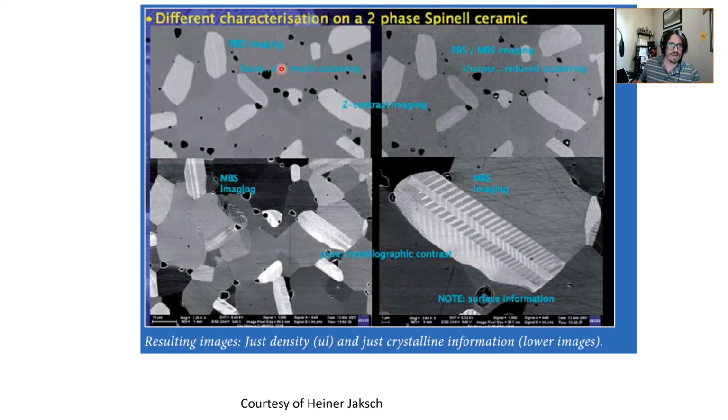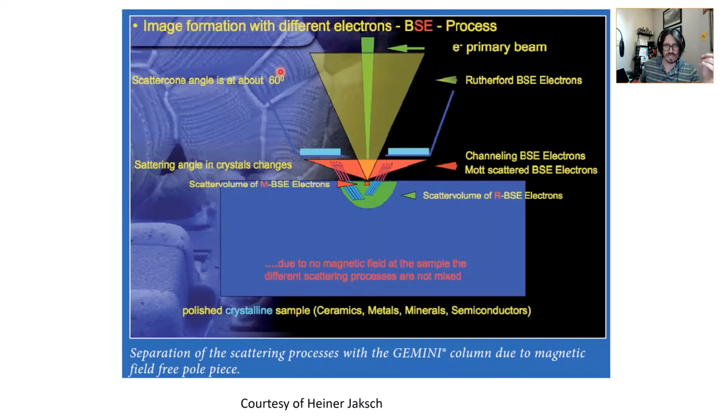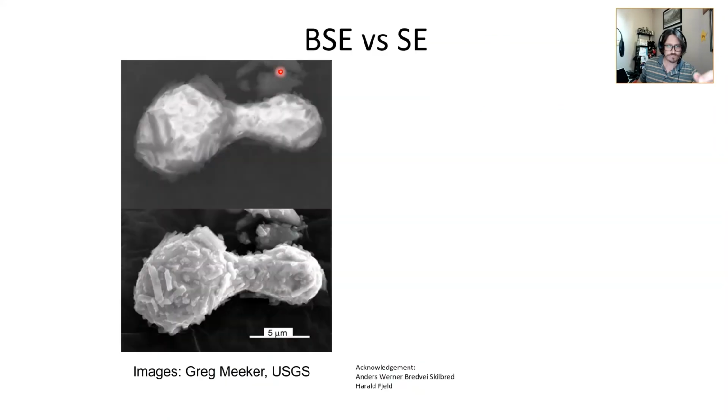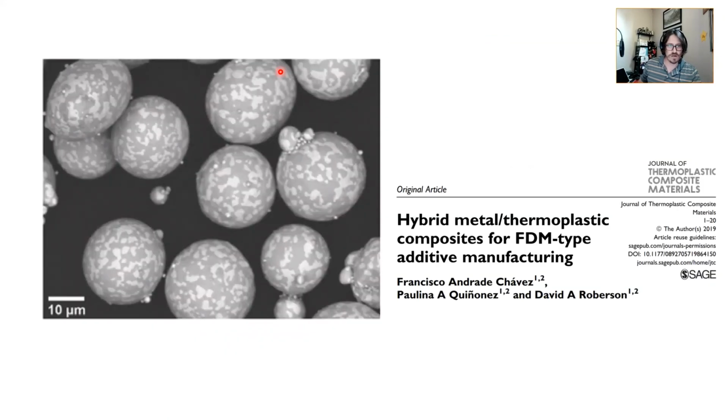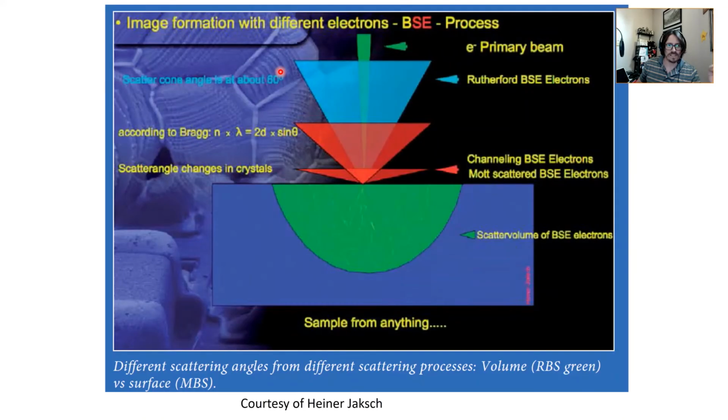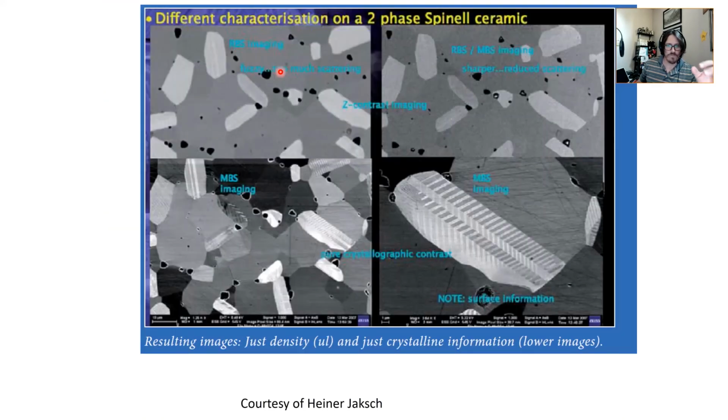So this is Rutherford backscattering imaging. Pretty much the images I've shown you back here, and I skipped this, and I need to get back to this. Back here with the solder or tin bismuth is Rutherford backscattering. You get good chemical discernment. Here, they're saying with their low-loss imaging, you get more information from this Mott backscatter. And so you have Rutherford backscatter, you've combined the signal with Rutherford and Mott, and they're right on.